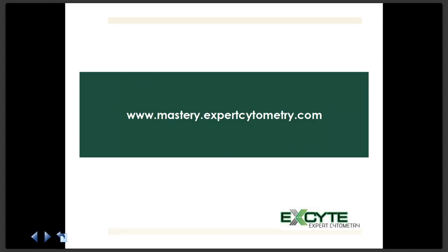Next question is from Verna. Vania. Again, I apologize if I said your name wrong. How to define the negative range on an X and Y axis in a quadrant graphic. The lines are fixed as a 10 to the third is a standard rule.